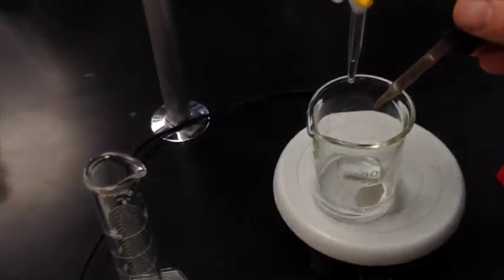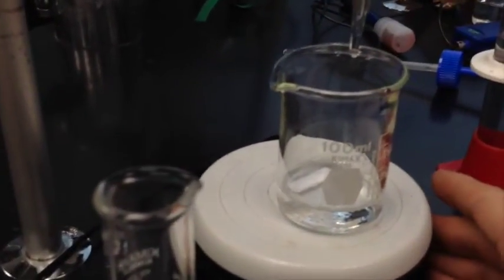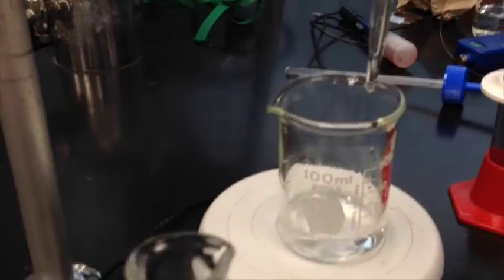Now what I'm going to do is take some phenolphthalein, down here, and with a little bit of focusing, I'm going to add a couple drops to my reaction vessel. And you can see it doesn't do anything, of course, because we know that's an acid. And now I set up a basic stirring apparatus. And now we'll know that the pH is 7 when the phenolphthalein flashes to purple. So the first thing I do is turn on and adjust the stir rod here until it's just nicely, gently stirring.